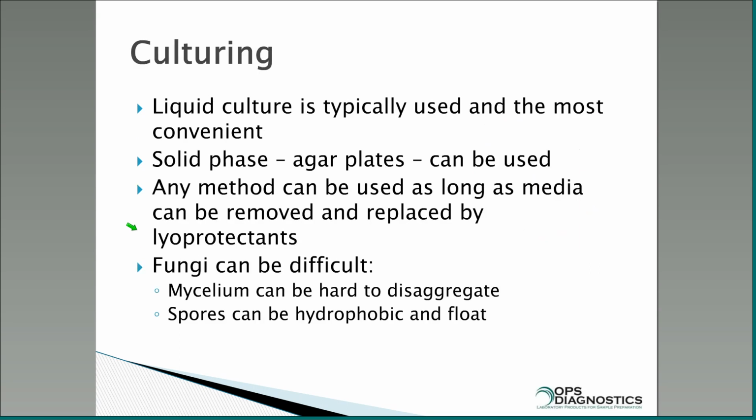All right, so the culturing. We are talking about microorganisms. My preference in doing this, and we've done a lot of work, we do some contract work on freeze drying for people, is that cultures are always the best. You grow it up, shake flask ideally, and all you have to do is harvest your cells and resuspend them in one of our buffers, and then aliquot them and freeze dry.